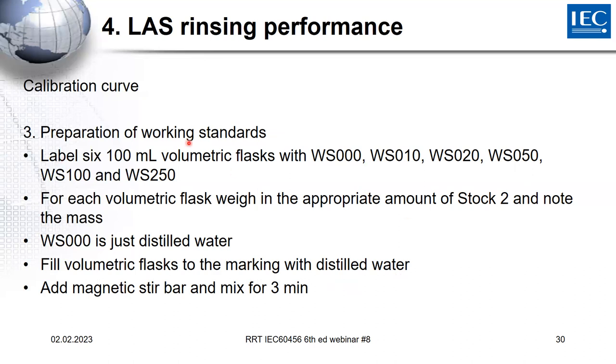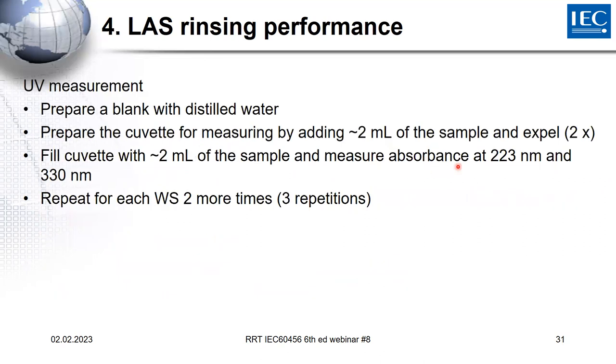And you will see those solutions are usually solutions where you don't see any particles left, also with this highest standard here. And then you do the calibration for this. And then you have 1 curve.